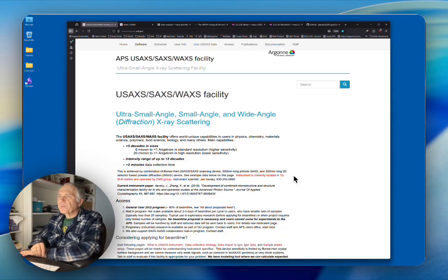Hello, welcome. This movie will walk you through some of the details of the ultra small angle scattering instrument and the data provided to users and how to get them easily into Igor or any other applications. This movie is really useful for either current, past, or future USAXS users. And unless you want to use my instrument, you probably don't need to bother watching it.